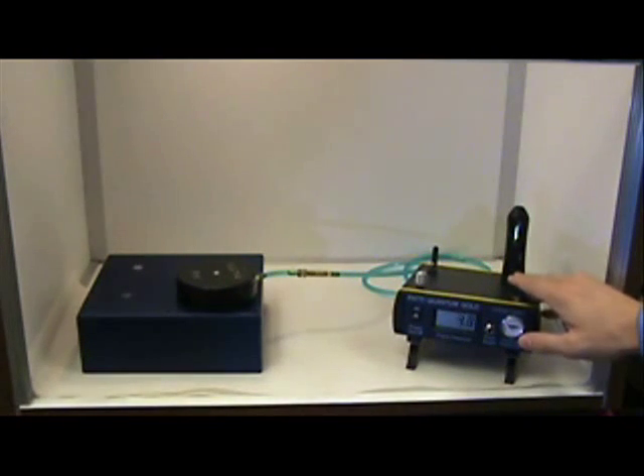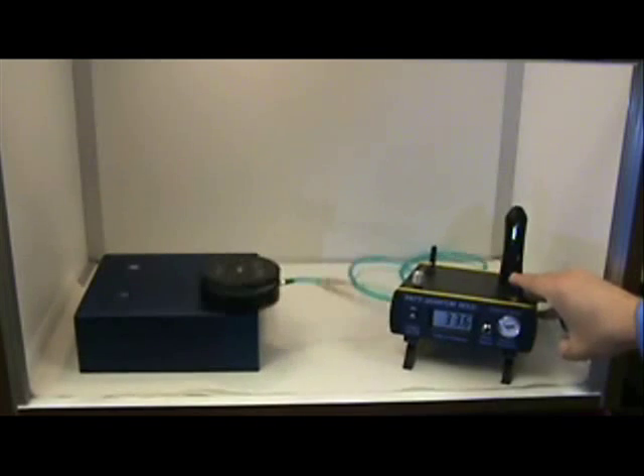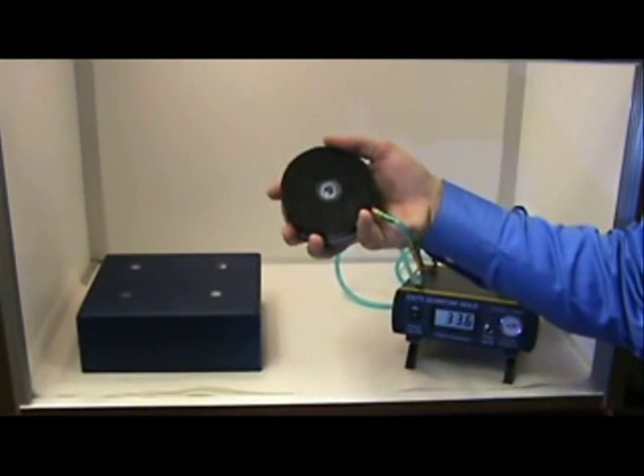The burst pressure is the number displayed on the digital readout. To convert that to tensile strength, you can use the conversion chart provided with your Patti or the LabVIEW software provided with the gold model.